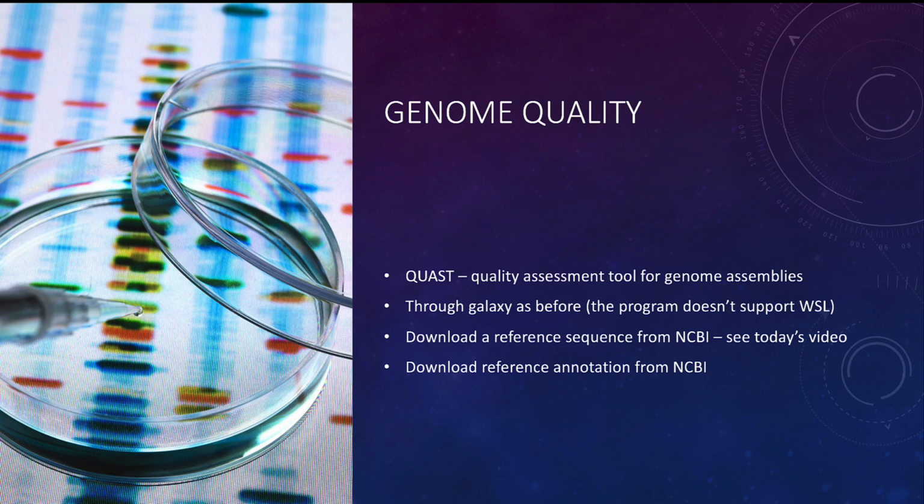We'll access QUAST through Galaxy, just like we accessed SPAdes through Galaxy. The developer of QUAST is the same developer as SPAdes, and that program is not supported on the Windows Subsystem for Linux. So instead of having the Mac people do it one way and the Linux people do it the other way, we're all just going to do it the same way. But any of you who do have a Mac and might be interested in using it through the command line interface on your computer, please do let me know, and I'm happy to show you how to do that.